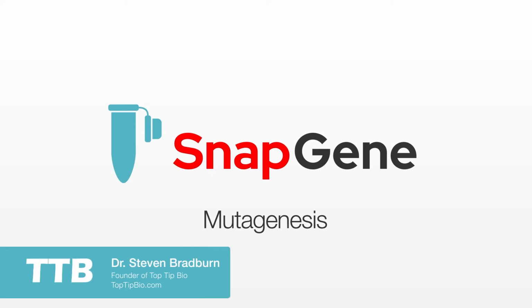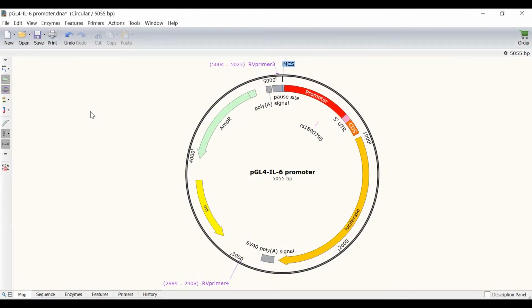In this video, I will show you how you can use SnapGene to create mutagenic primers and simulate a mutagenesis reaction. To demonstrate this, I have a file open containing a PGL4 plasmid with the interleukin-6 gene promoter region. The promoter region can be seen here by this collection of features.